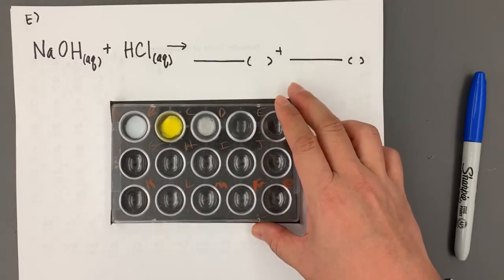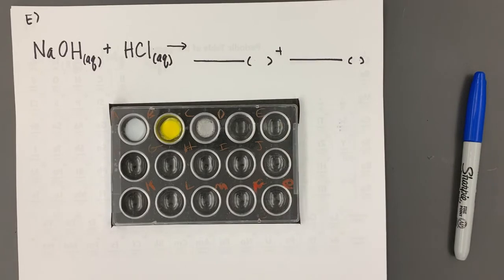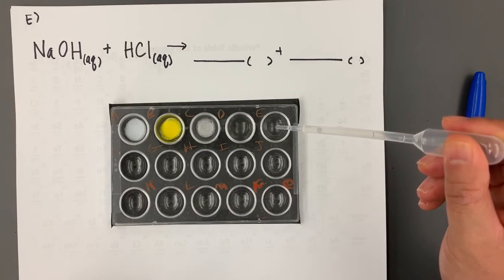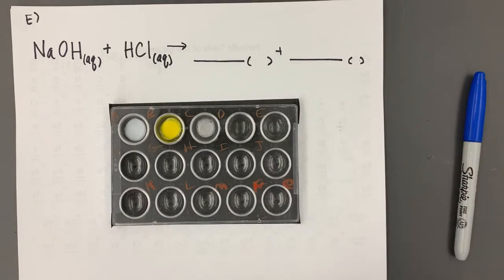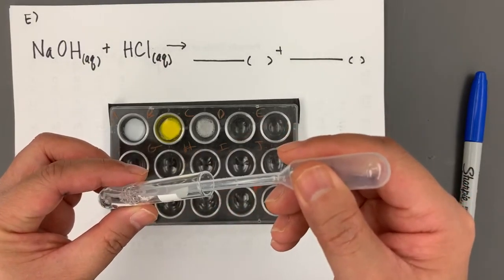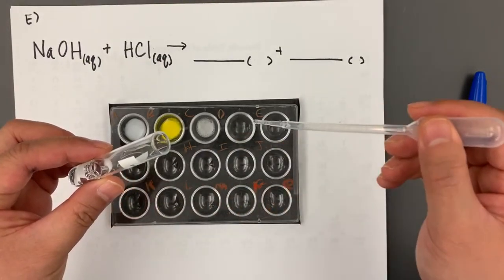Okay. For the next one, we're going to do sodium hydroxide and HCl. Okay, and again, both of these are colorless solutions.